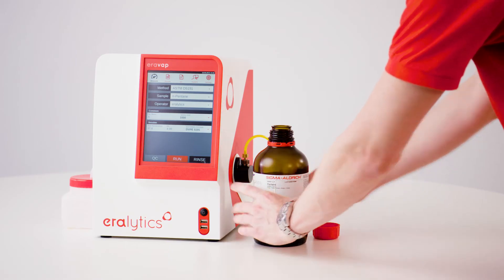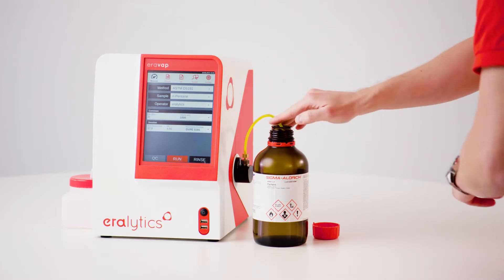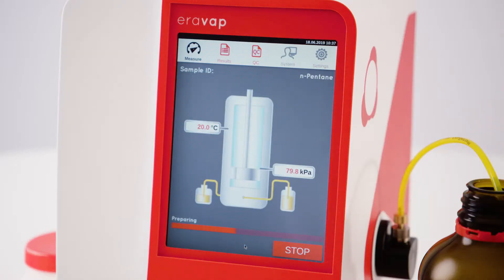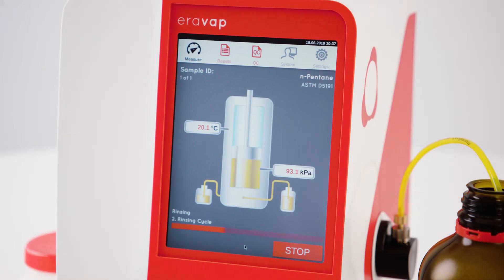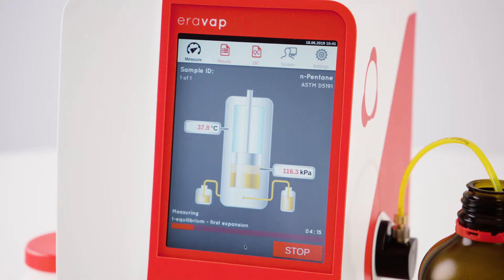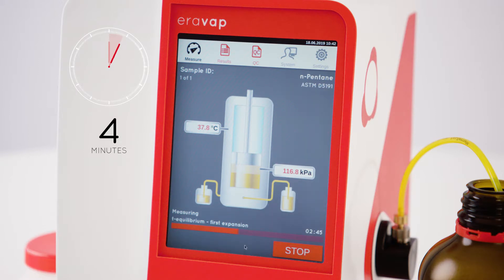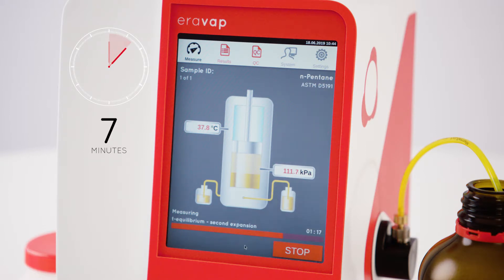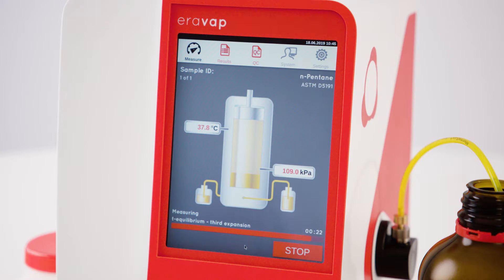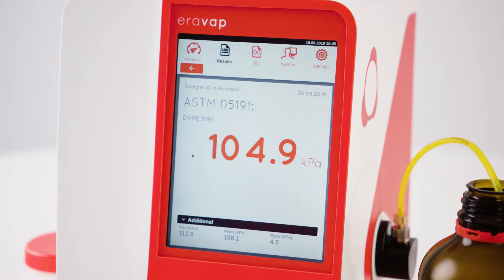Place the inlet tube in the sample container and press RUN to start the fully automated measurement. Live sensor readings and an illustration of the progress are displayed on the screen during the measurement. The duration of an ASTM D5191 measurement is approximately 7 minutes. After the measurement is completed, the detailed results screen is shown.